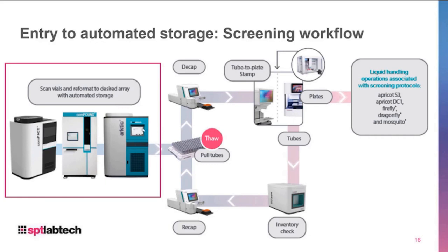In some cases, you could also think of this as a direct integration platform or a work cell, not separate bits of kit around the lab. Just ways to think about it. Much less manual touch points.